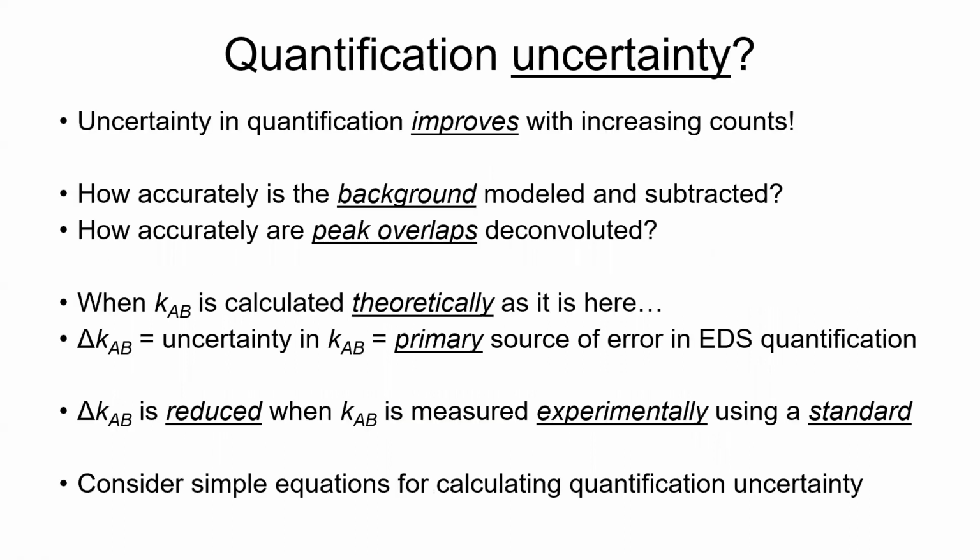Okay, all right. So we've gone through all 4 of those parameters: sigma, A, omega, and epsilon. One of the questions that comes up a lot is how accurate is your quantification? So this gets us into uncertainty analysis, which I'm going to go over briefly here in just a couple slides.